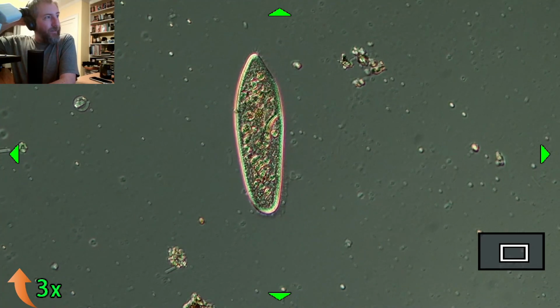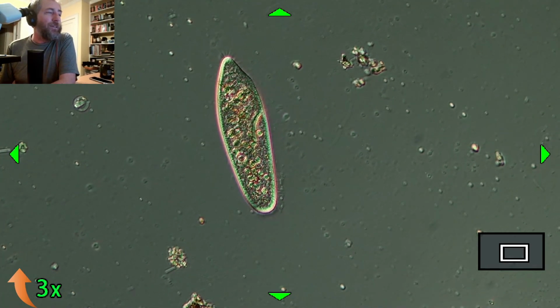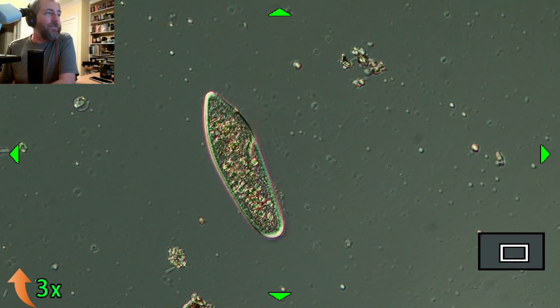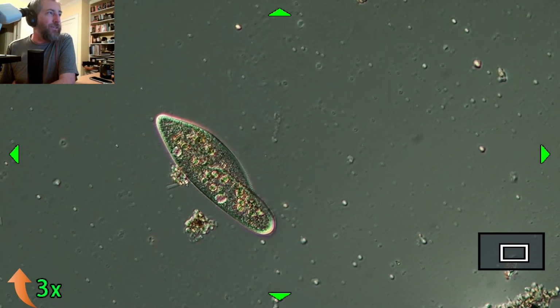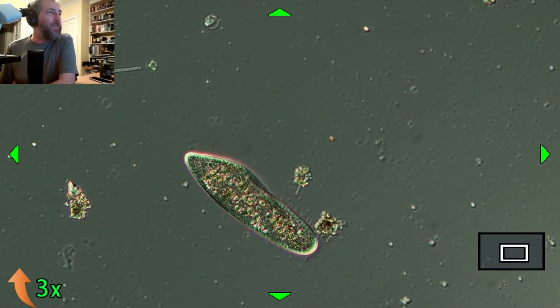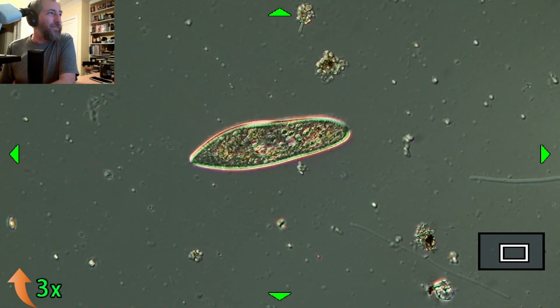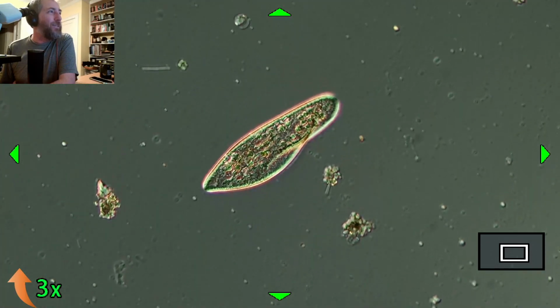Pretty common for people to look at them in elementary school. You probably don't have views quite like these. This is a $20,000 microscope with a differential interference contrast objective on it and a $1,000 camera attached to it. So probably didn't get views like this in high school. But if you did, probably went to a pretty rich school.